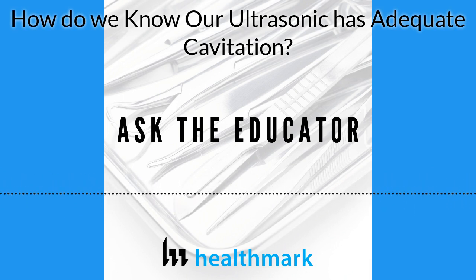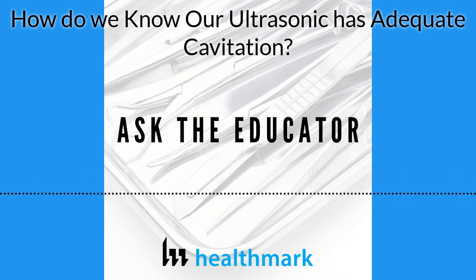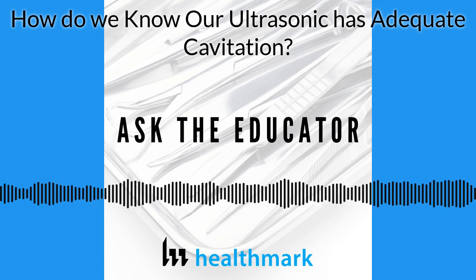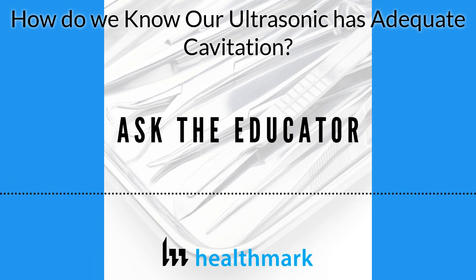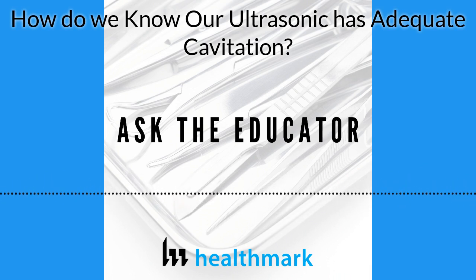One is, where is the placement of the transducers? The farther you are away from the transducer, the less cavitation energy will reach. So on a lot of these 3 levels, some only have it on the bottom, some put some on the bottom and the side, but there's still a big difference between the bottom, the middle, and the top. So that's factor 1.